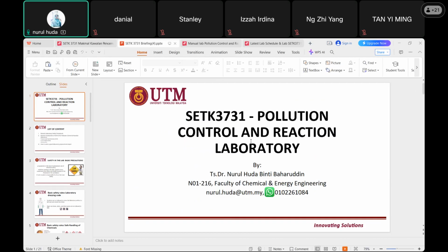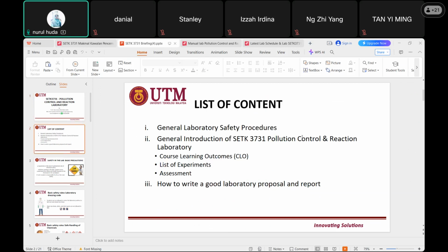Alright. First of all, please listen carefully, because it is not just a safety briefing. We also explain how to write a proposal and the final report, so that when you do your first writing you will have an idea of how to start. For pollution and reaction laboratory, this safety briefing is compulsory.